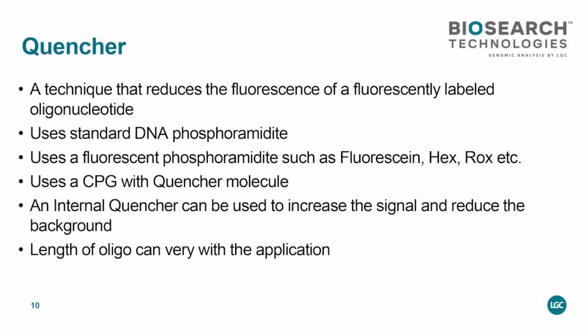So you will have quencher, DNA, quencher, fluorophore. And for different applications or different pairing of fluorophore and quencher, you will play around with a different length of your oligo as well. But those oligos are no more than 30-mers, 35-mers. So this is easy to make. And as I say, having your own capabilities in the laboratory and not waiting for weeks and weeks and months of getting something from an oligo house has actually been very beneficial during the last few years for people.